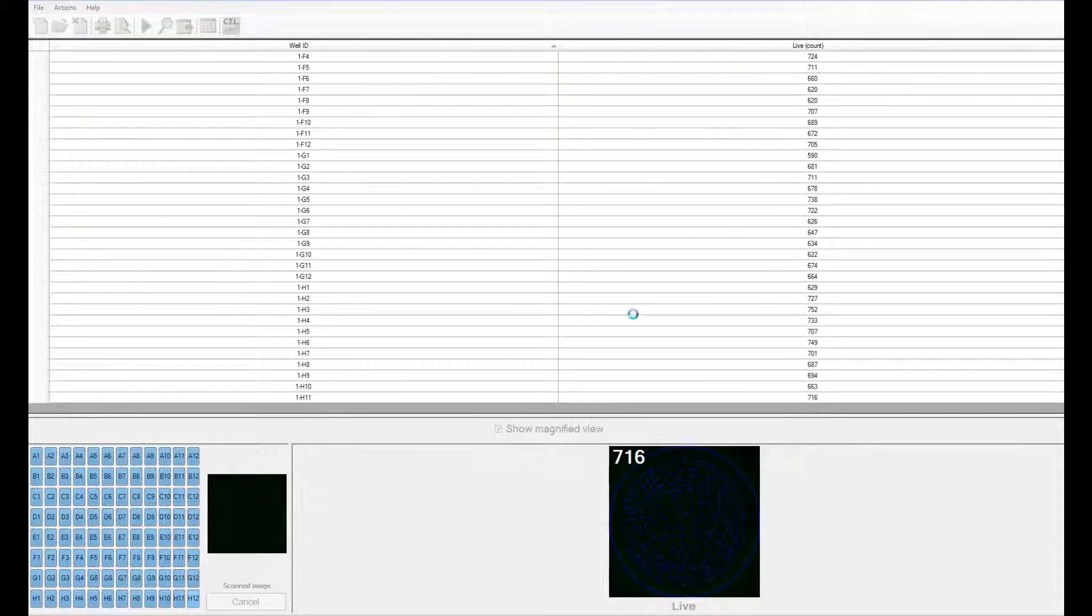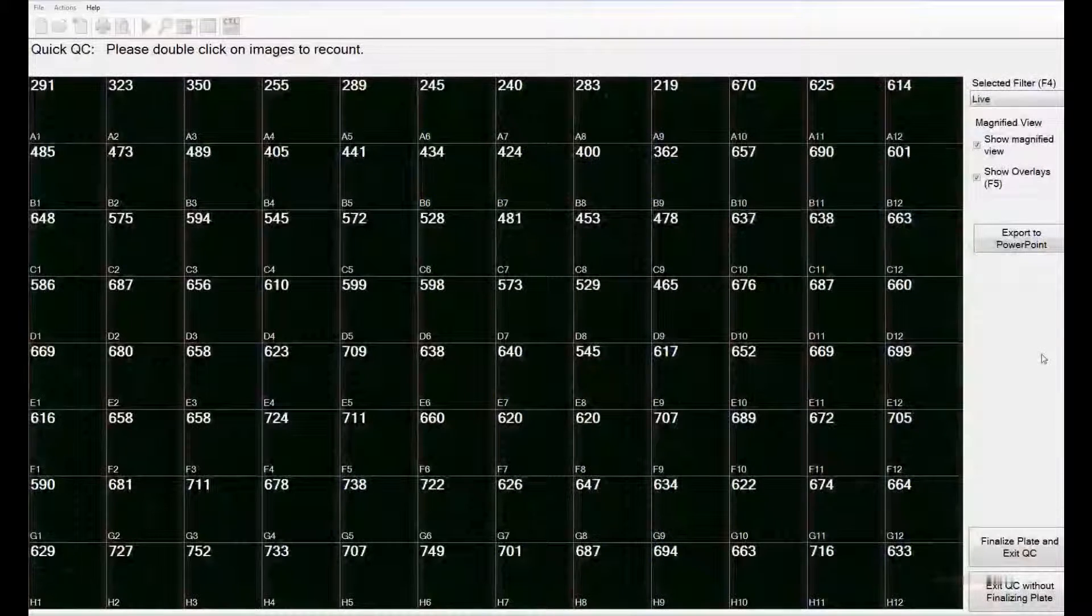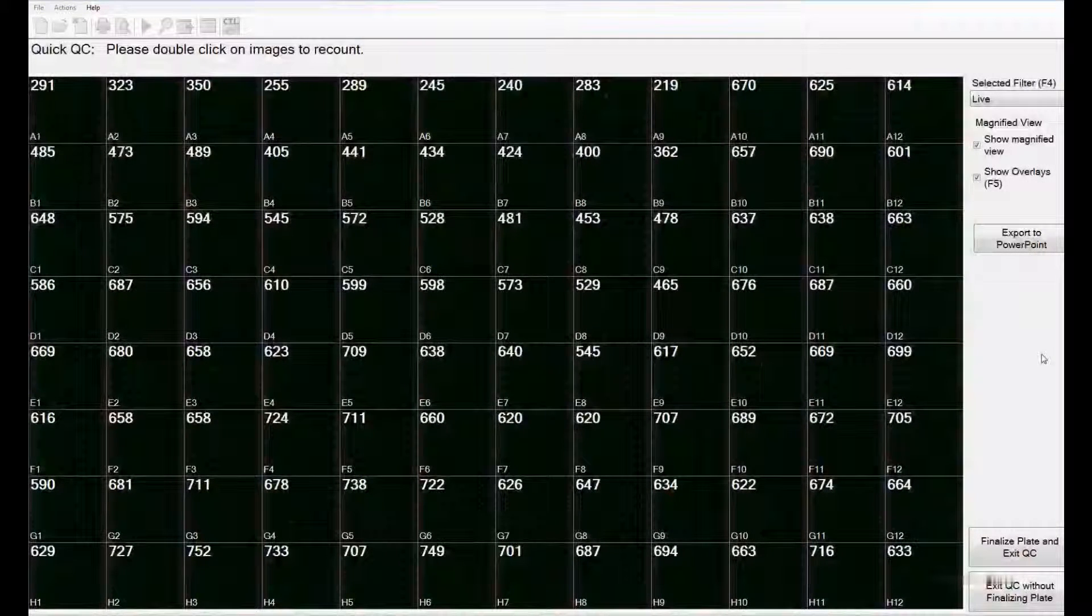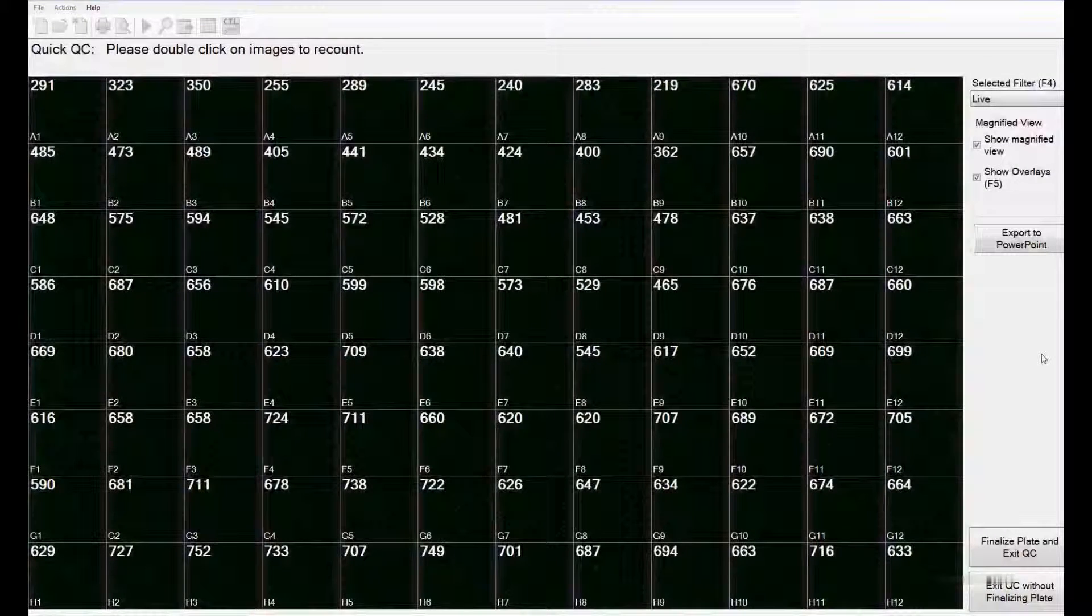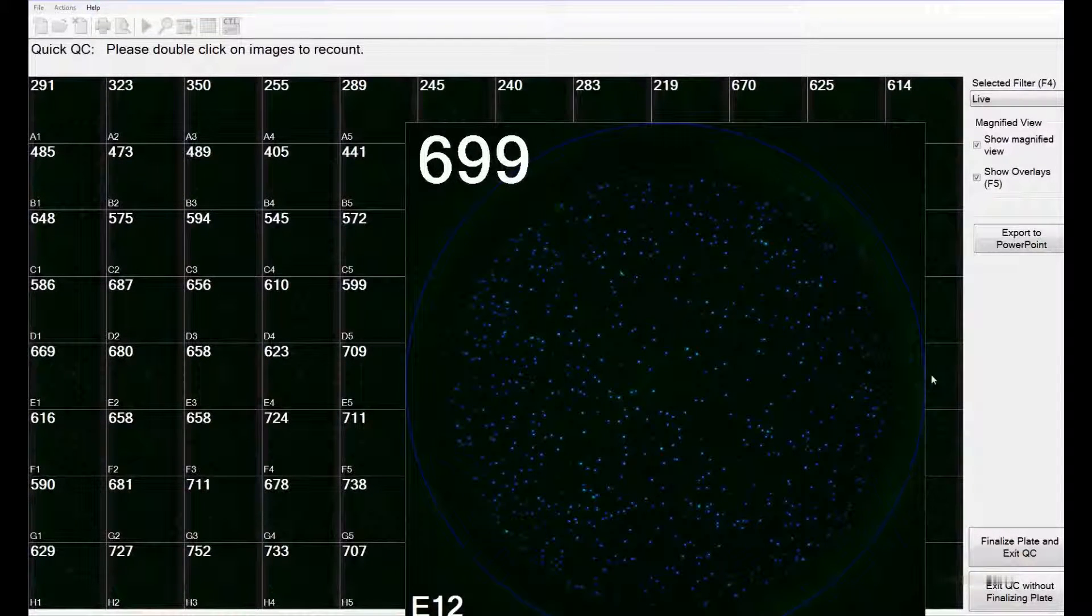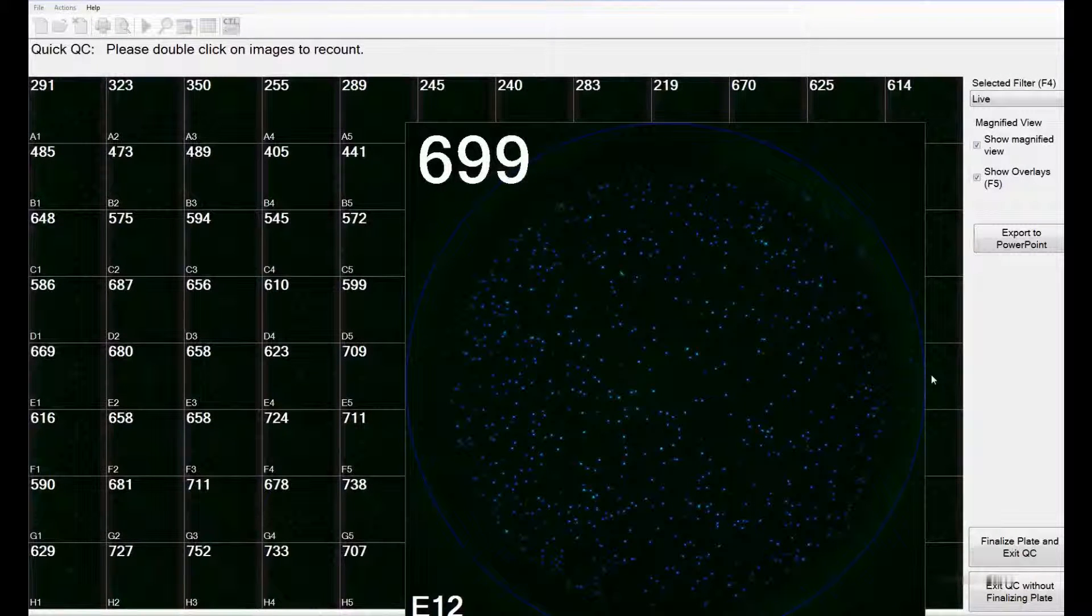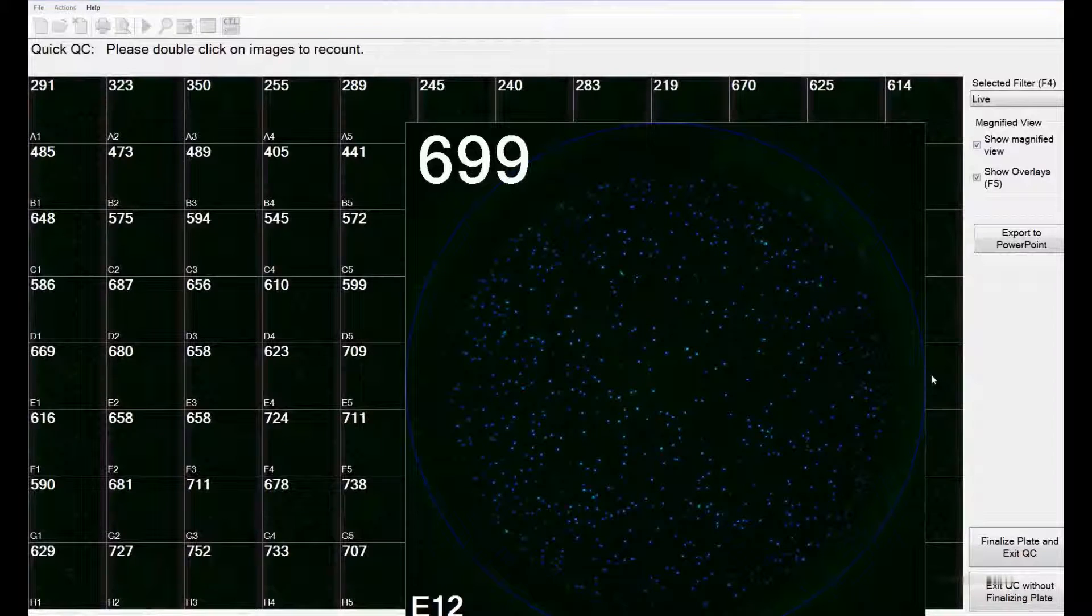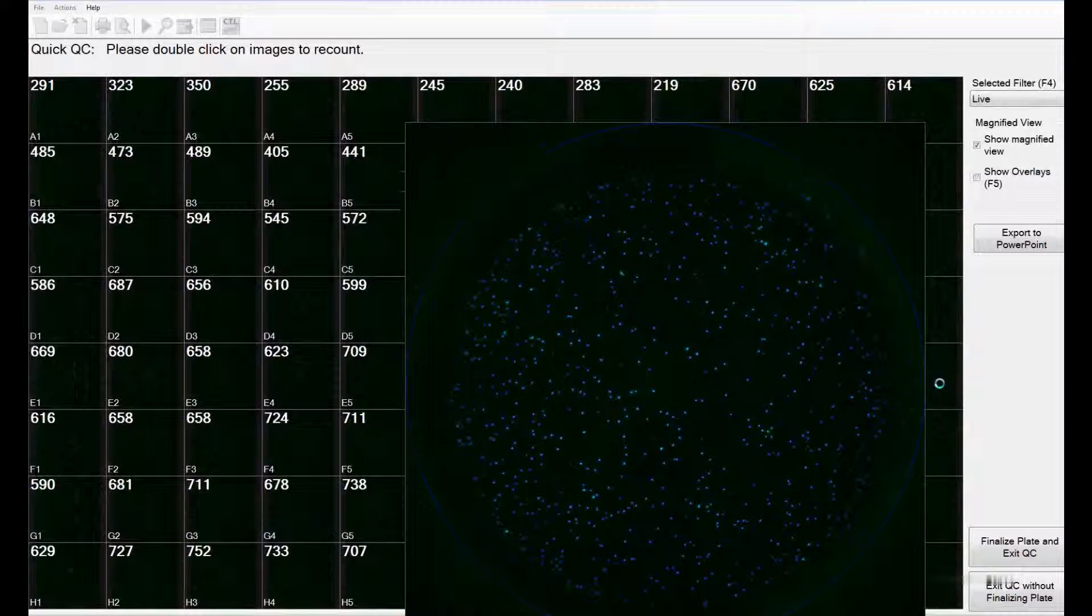The software then generates an overview of all the images that it scanned and counted. By hovering over these images, you can see a magnified view. To check the overlays of the counted versus non-counted cells, you can use the F5 key on your keyboard.